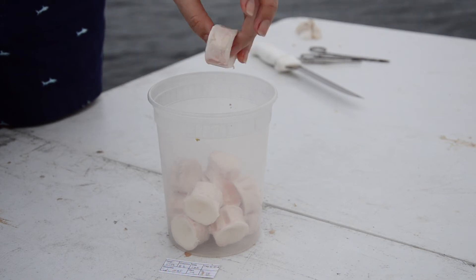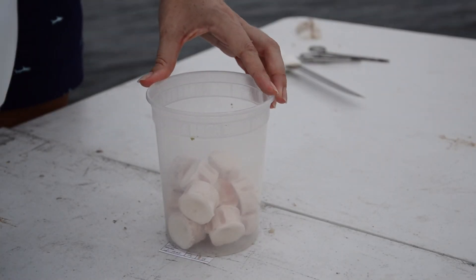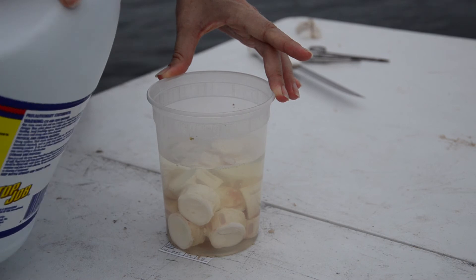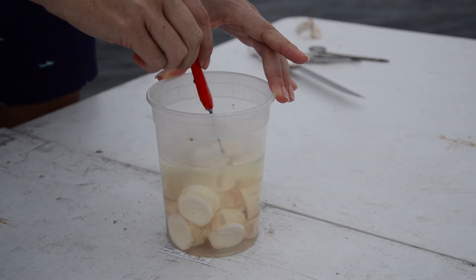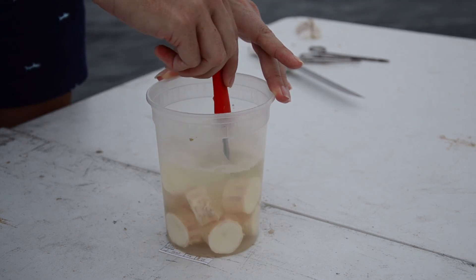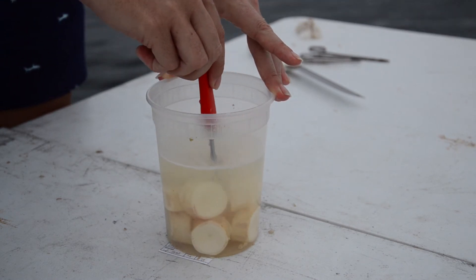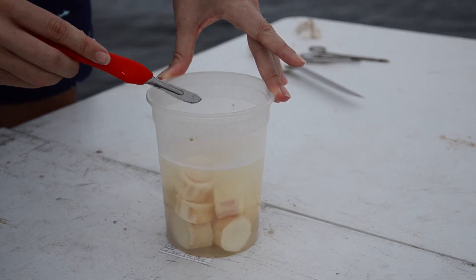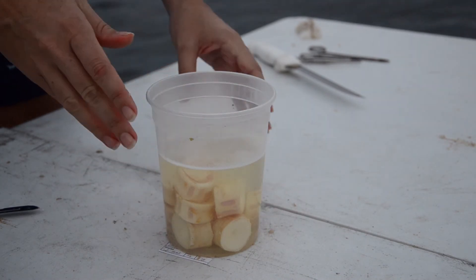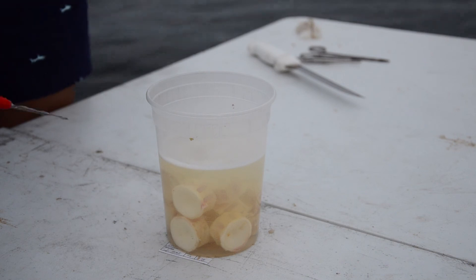Here we have our cleaned vertebrae going into a container filled with bleach with about an inch to spare. This is five percent sodium hypochlorite and it's going to eat away at the remaining flesh. It's a chemical reaction so we want to give it plenty of room to work. Stir it first — you'll see almost immediately it starts to bubble up, that's what's removing the flesh. Make sure there are no pockets of air. The container will start to heat up and you can feel that from the outside. About every ten minutes give it a good stir to free up bubbles and ensure the reaction continues.